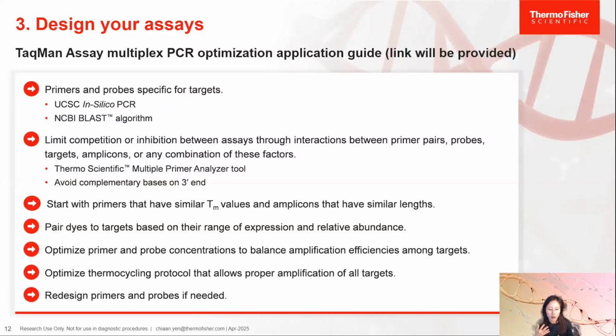There are also tools that can predict hairpin structures. But because these are all predicted interactions, the most important thing is definitely testing it empirically. And really look out for complementary bases on the 3' end, because that's what's going to sit down on your sequence first, and then if it gets extended, it gets extended. That is something I also look out for when I design my primers.